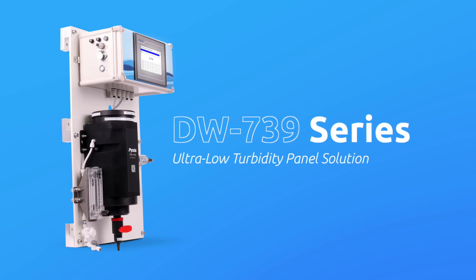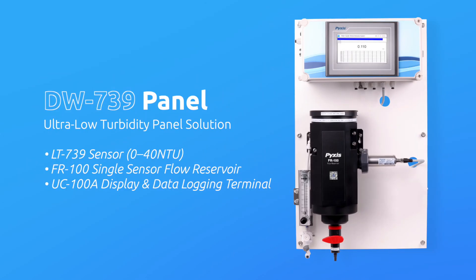As an alternative to the DW2100P, the DW739 series are single-parameter inline turbidity analyzers specifically designed as a turnkey monitoring solution for clean water applications. The DW739 is identical in all ways to the DW2100P, but is a single-parameter panel that utilizes the LT739 series sensor, offering highly accurate real-time measurement, display, and data logging of ultra-low turbidity. This panel comes equipped with the FR100 single sensor flow reservoir, inlet PRV, rotameter, and the UC100A touchscreen display and data logging terminal, and is pre-wired and pre-configured in the same format as the DW2100P. This panel is ideal for those desiring a convenient and easy-to-integrate ultra-low turbidity analyzer for drinking and clean water applications.